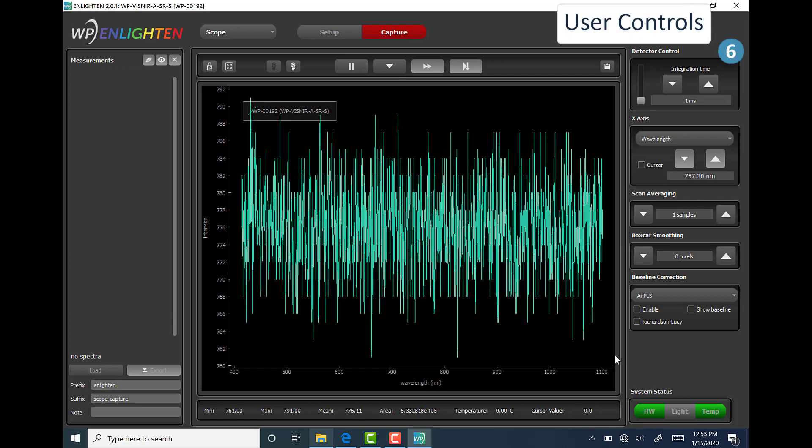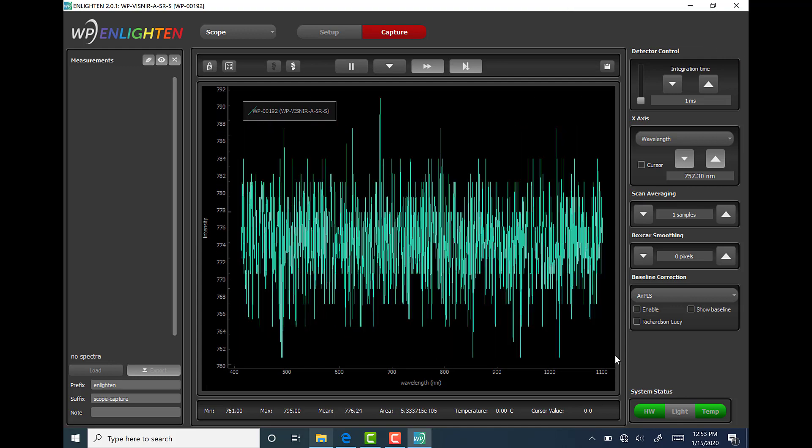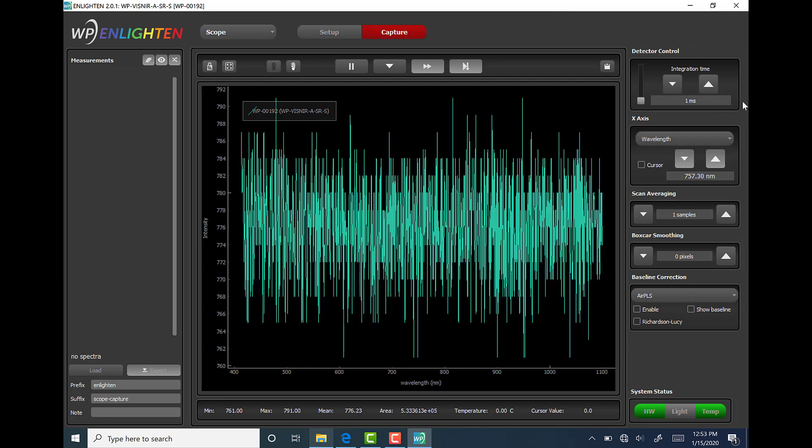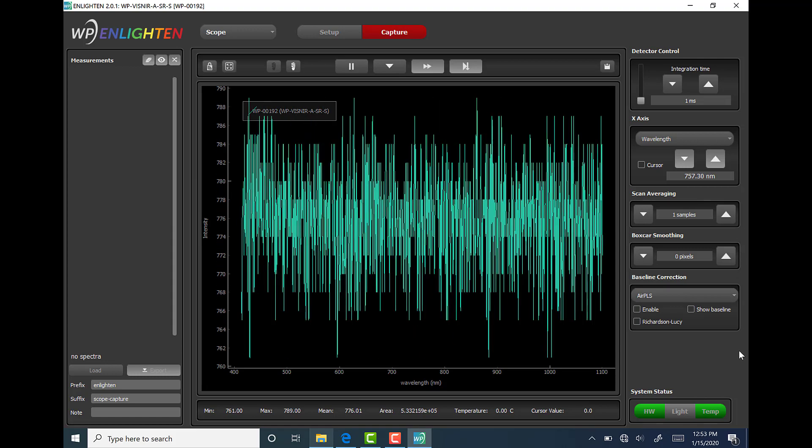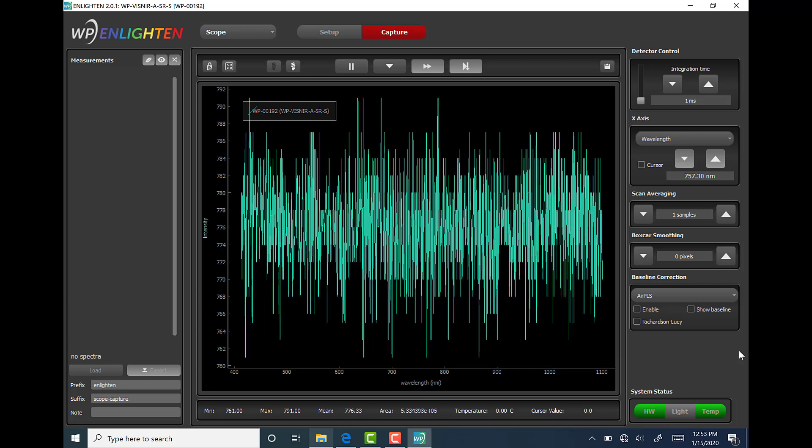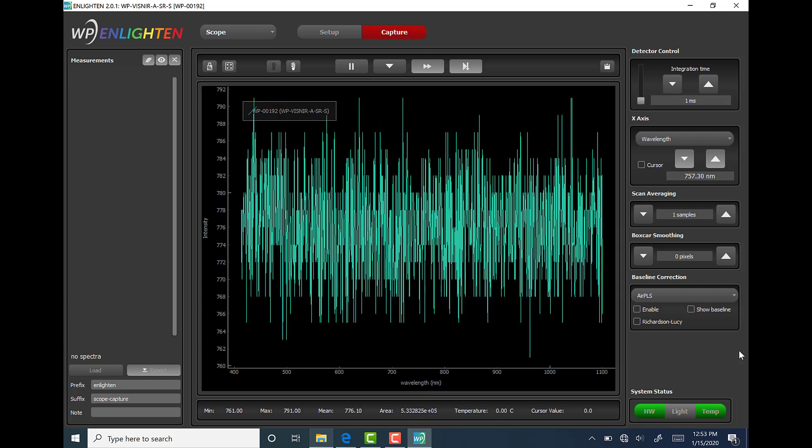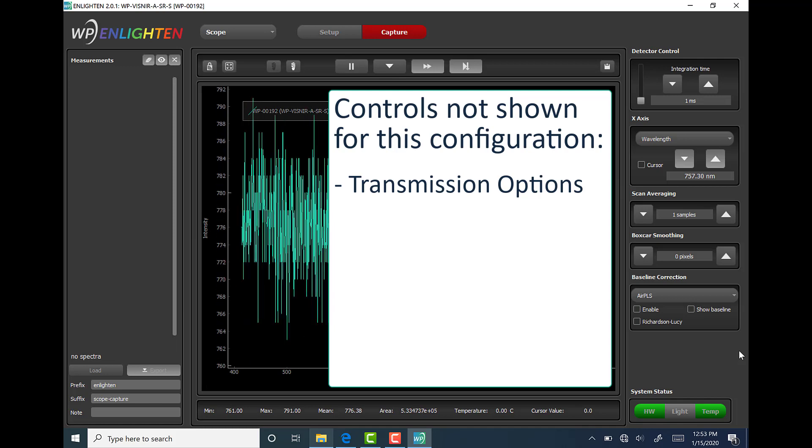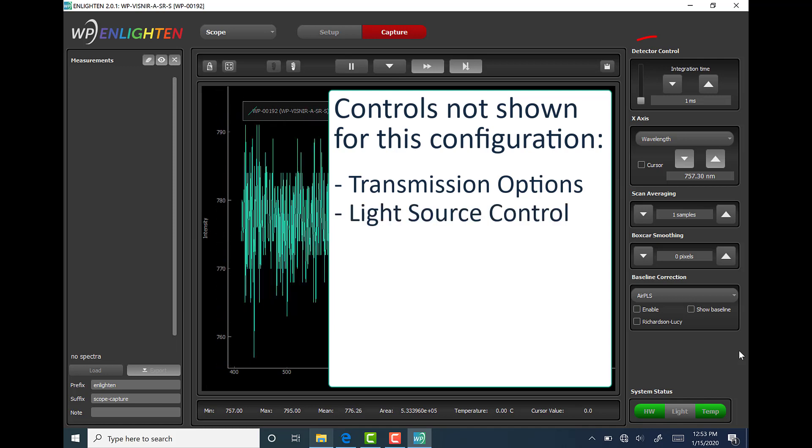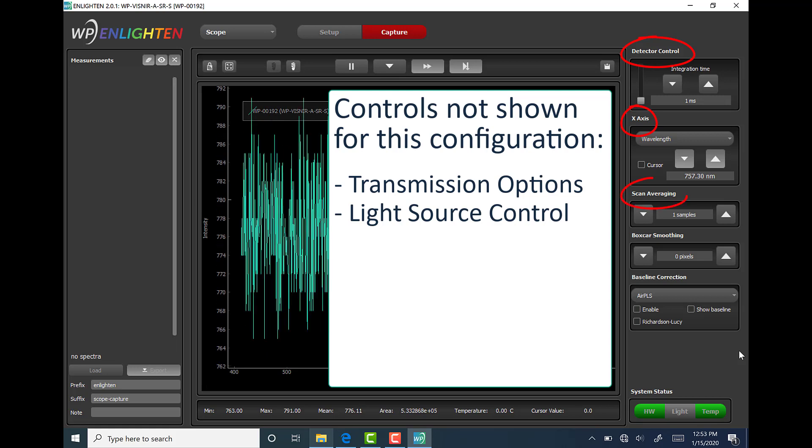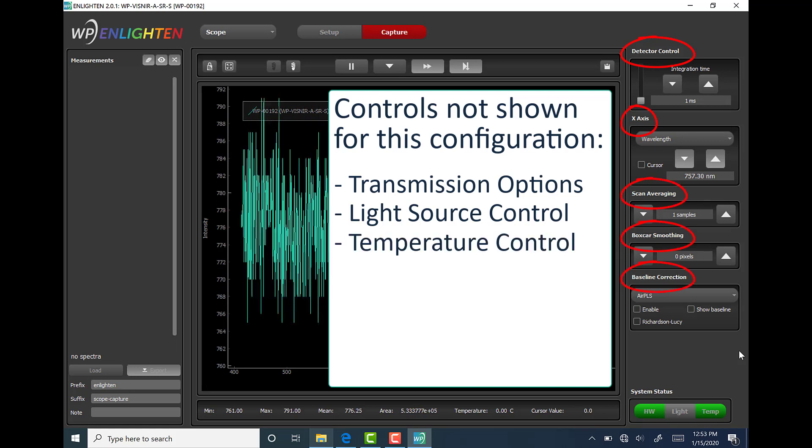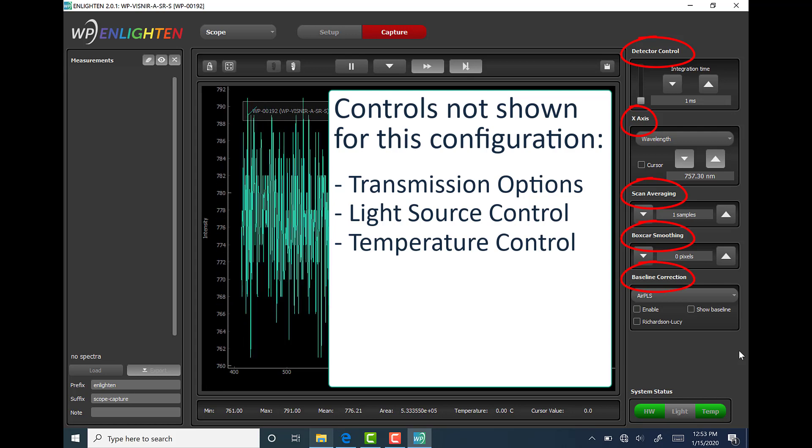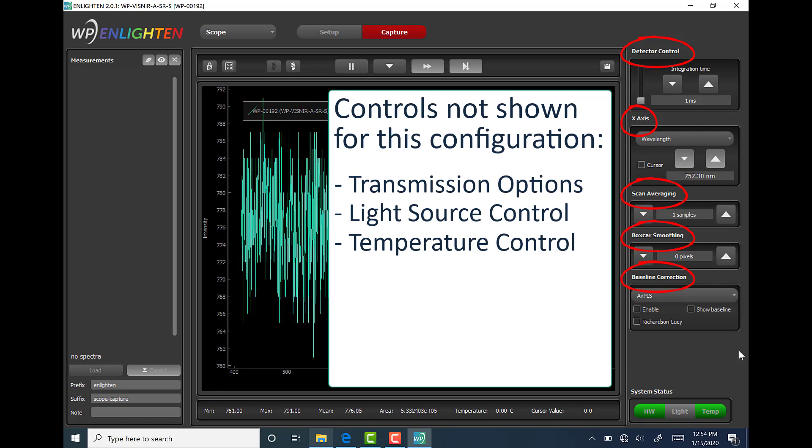The next is user controls. This scrollable column on the right side of the software window houses a multitude of spectrometer and view controls. The controls that are visible will vary depending on the spectrometer that is connected because some of the controls are very specific to the type of hardware being used. Some of these controls include transmission options, light source control, detector control, x-axis, scan averaging, boxcar smoothing, baseline correction, and temperature control. There is a lot to say about each of these functions and those details will also be discussed in a future video.